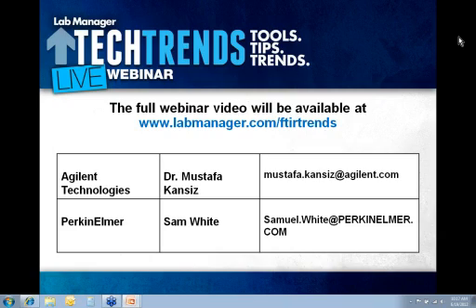Okay. The other thing, and I don't know much about that field, but the information you get is not very diagnostic organically. You do get the elemental information, but you don't get much information organically, which is what infrared will do for you. I see. And there are no specific bands or hydrogen bonds or anything like that which can be determined? Well, we don't know. What we can do is, like I mentioned in the previous case, we can forward you the attendee's contact information, and maybe you can follow up with him offline to see how you can help him.